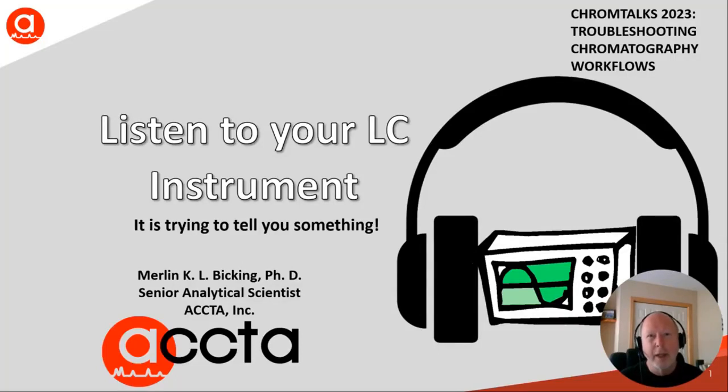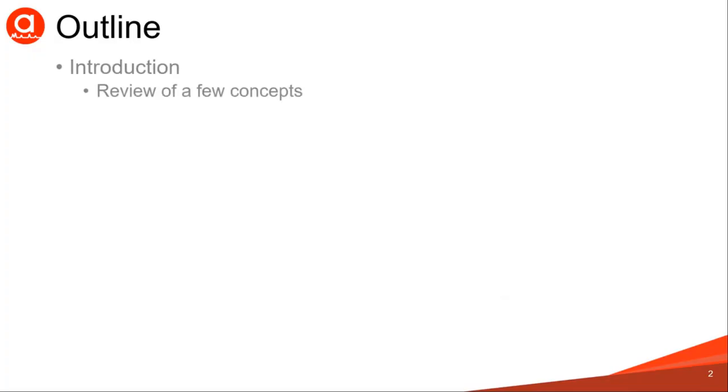I'm Merlin Bicking, and my talk is Listen to Your LC Instrument. It's trying to tell you something. Let's get started. We will start with a review of a few concepts.